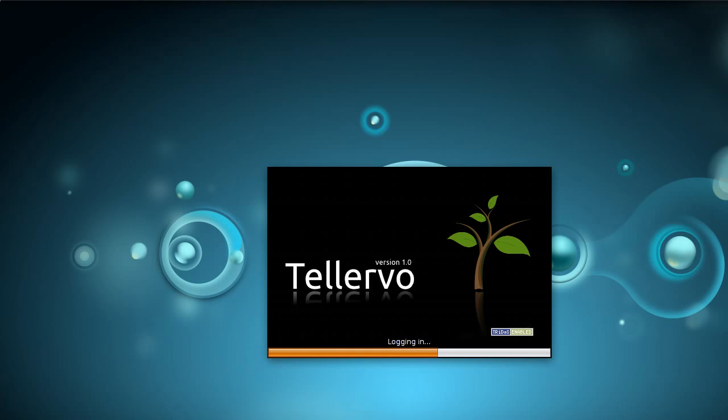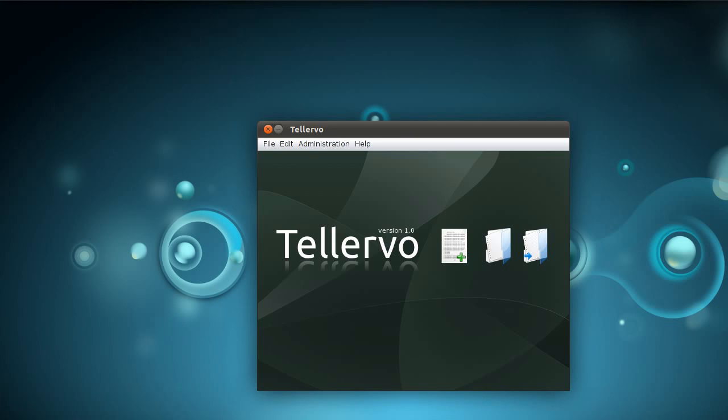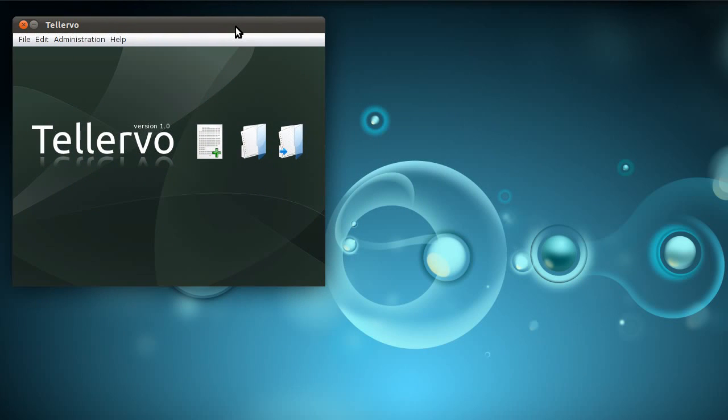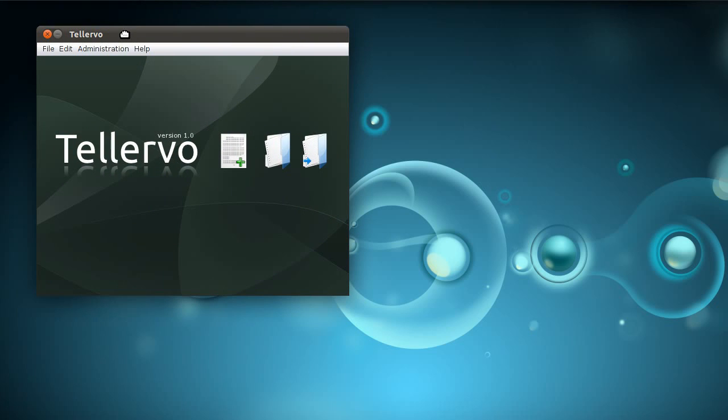Okay, so this screencast tutorial is going to take you through the steps required to enter basic metadata about your samples. So the idea is that when you've come back from the field, you've collected many samples from perhaps several sites. You want to try and get all this information from your field notes into the database as quickly as possible.